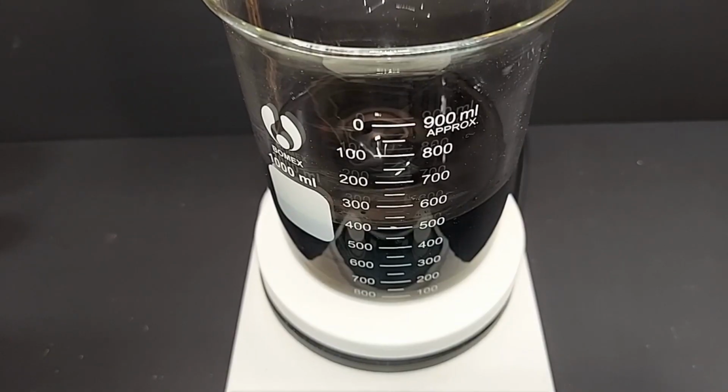So I really believe this is definitely too concentrated, and I think I know what ended up happening now that I've had a minute to think about it. We added hydrochloric acid and hydrogen peroxide, of course, but I did have to add extra hydrogen peroxide to get all of that copper to dissolve. And I think what happened was I was heating it maybe a little bit too much, and hydrogen peroxide is broken down by heat much easier than hydrochloric acid. And I think that's what was happening. It was breaking down, so I had to add more to get all the copper dissolved.